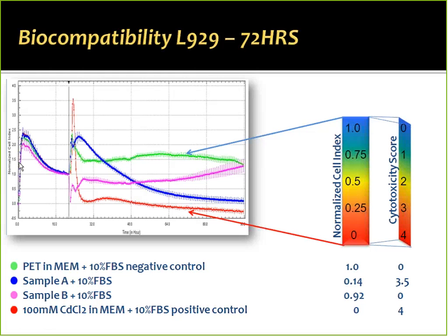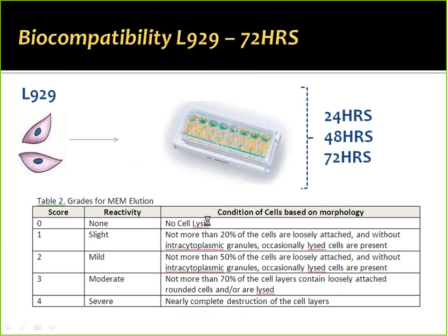Here we can set up an experiment. We usually have cells growing in the incubator. We can set up an experiment a day later with the extracted materials, and then 3 days later have a result. So in 4 days, we can turn around and tell our engineers that they're on the right track with the material, or let them know that they're going to have some difficulty moving forward with that process, instead of having to wait month after month in case we have a lot of failures.